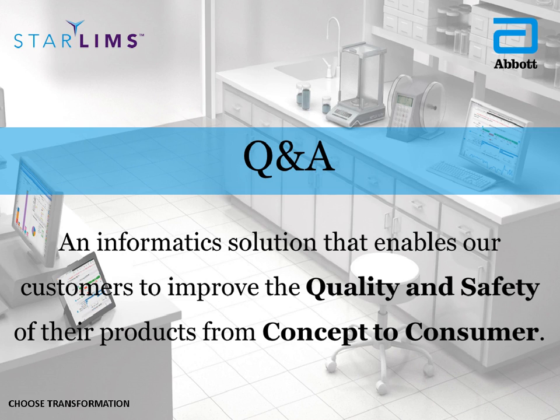Great, thank you, Carla. The next question: when using the mobile app at a collection site, after scanning the kit, is it possible to scan something associated with the patient information to that kit? Yes, we can also scan patient information data associated with it. In the example I had here in the content library for this sample kit collection, it's actually doing that. It could be a subject ID that we already know, or a patient ID that the system already knows about. By scanning that, it will just load the information, but it will also give you the option, if it doesn't recognize it, to enter the information of the subject.